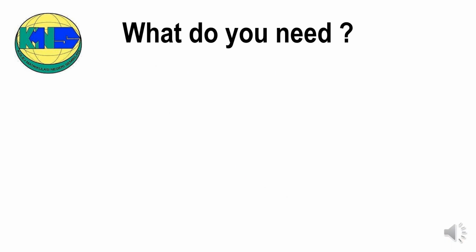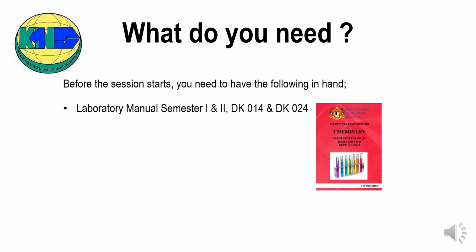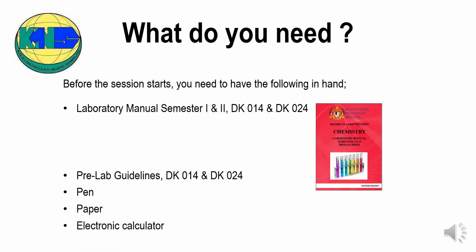First, what do you need to begin the session? You need to have the following in hand. A laboratory manual, semester 1 and 2, DK014 and DK024. Pre-lab guidelines, DK014 and DK024. A pen, a paper, and an electronic calculator.